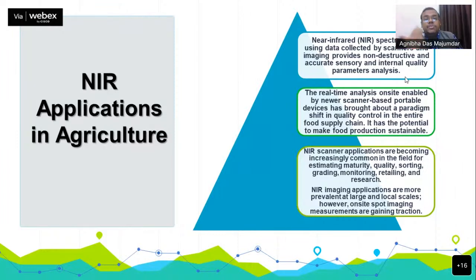So some health issues will be there. That is why, to check the internal quality of any food product, we can use the NIR spectrometer. Even many people have developed portable handy NIR spectrometers with which we can easily check the quality of any food product anywhere.